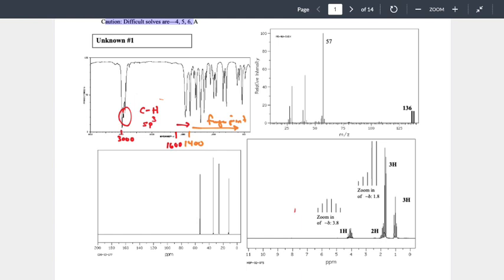Okay. It is the peak furthest to the right. Okay, so there's our peak furthest to the right. Then what? Because it's not the peak furthest to the right. That's only half of it. The tallest peak within 3 units of that peak.